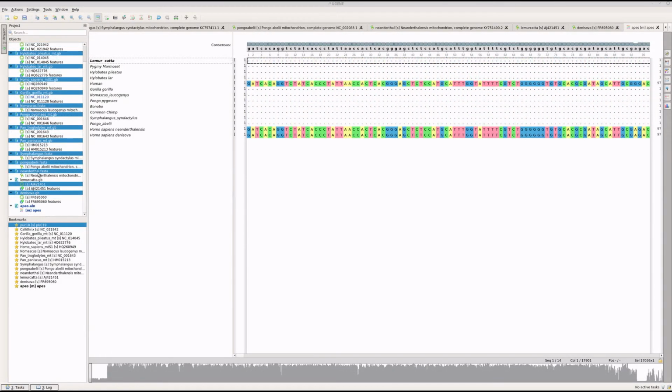Okay, so we're back now, and what happened was it took a very long time. It was very computationally intensive. Even though these files are very small, it's doing something very heavy in terms of doing its alignment. And what you see here is a bunch of dashes, but what that ultimately means is that it has aligned them to the best of their ability. And so you can see down here, there's a sort of graphical representation of the best alignments, right, that have occurred. So the highest alignments are like those that reach all the way to the top.